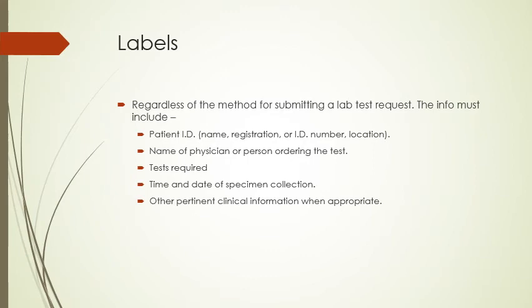Regardless of the method for submitting a lab test request, all those things we just talked about, I'm not going to go over them again. I'm going to make it quick and painless for you here. All the things we just talked about need to be on there. I can't highlight that enough, and you're checking it every single time.